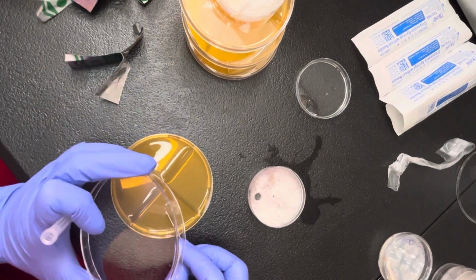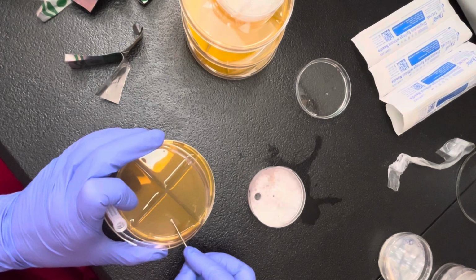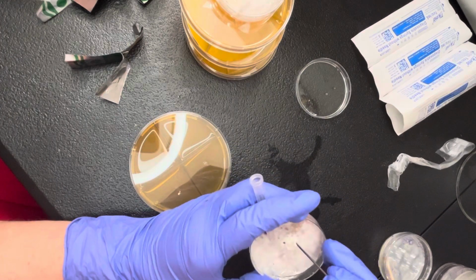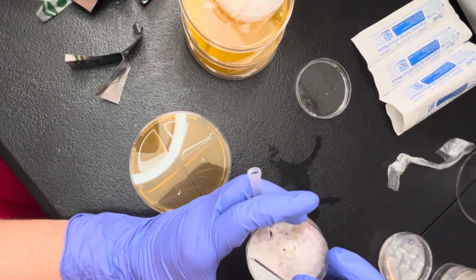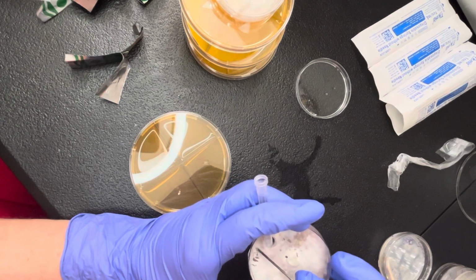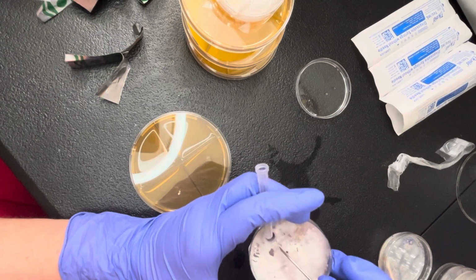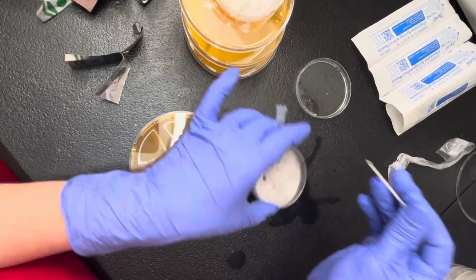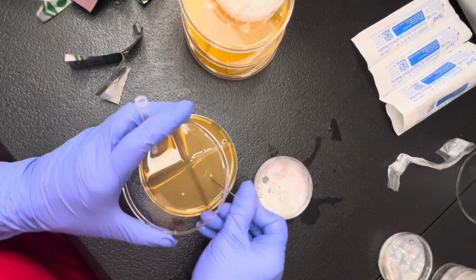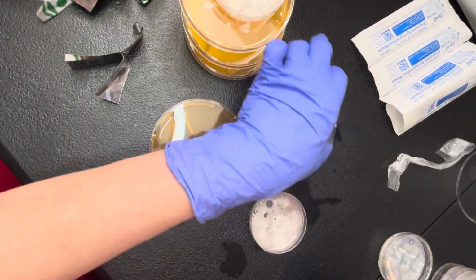And you just want to dab it right into the agar, or lay it on top is fine too. Ooh, just give me some problems. I'll just go around the edge here. And this is a purple mystic clone that I'm working on that I did a long time ago.